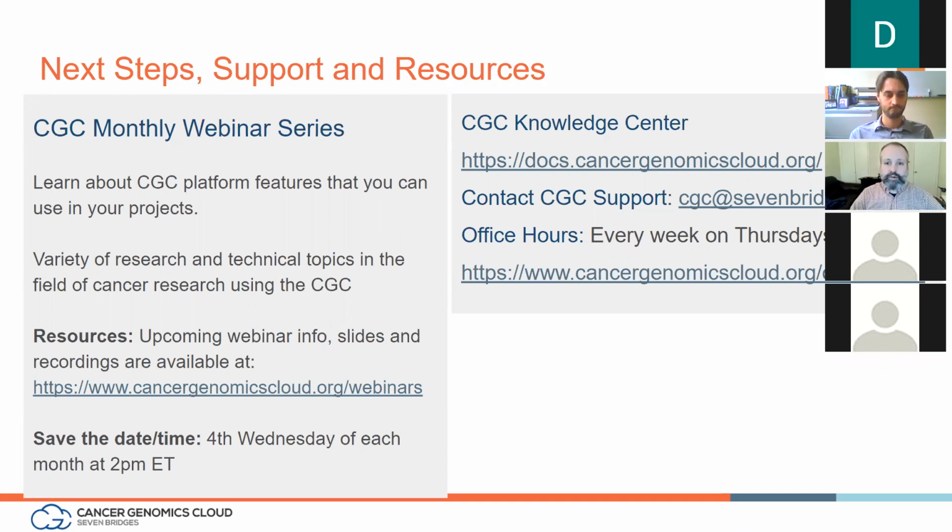If you need support, we're here for you. So there's docs at docs.cancergenomicscloud.org. You can contact support 24/7 at cgc@sevenbridges.com. That actually gets sent to a support team, and they're basically staffed almost 24 hours a day, and they'll get you the support you need for any issue you may have with your analysis.